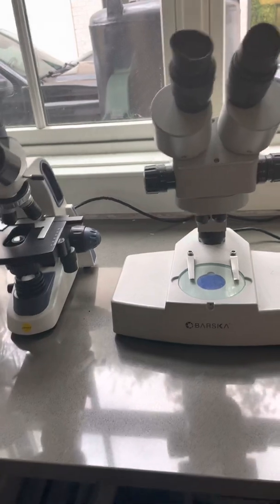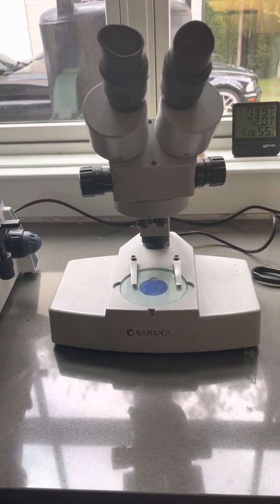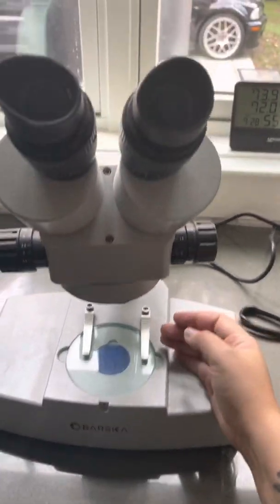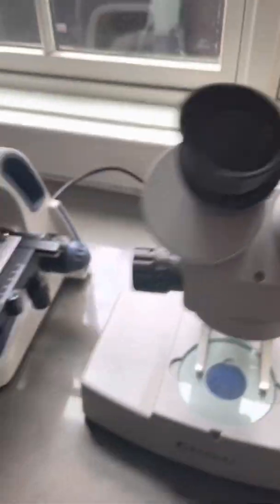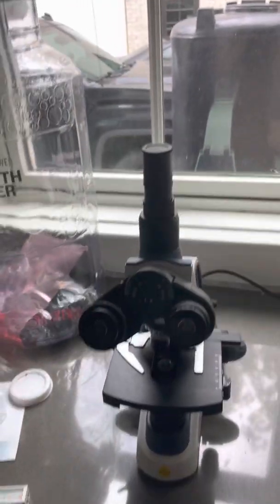For the room. And here's a microscope — I'm blanking on the name. It's like a specimen scope, so you just put the specimen right there, you can have it alive, and look through it. And then this is a compound scope.